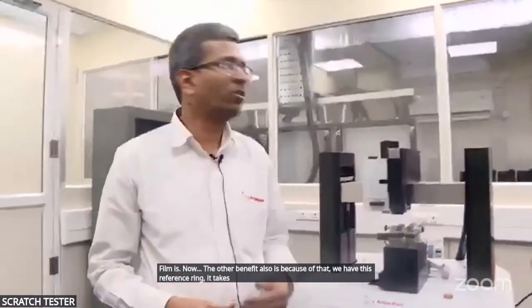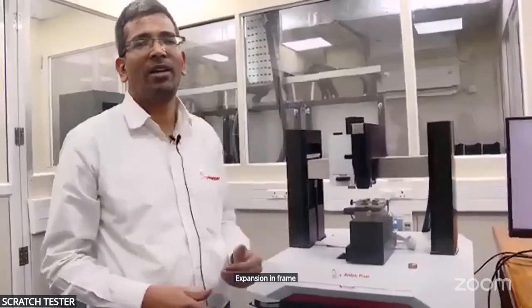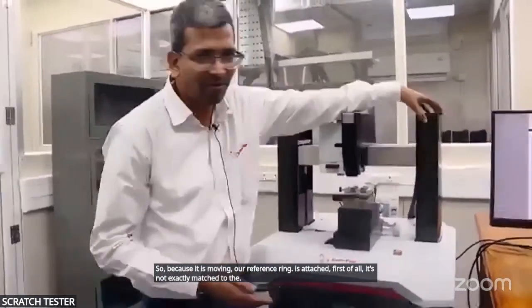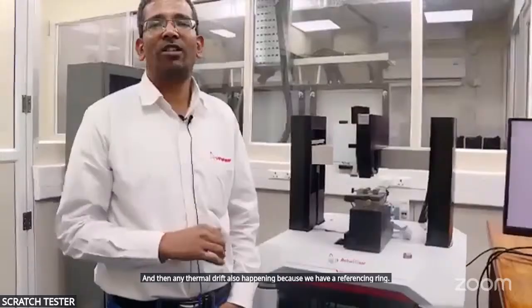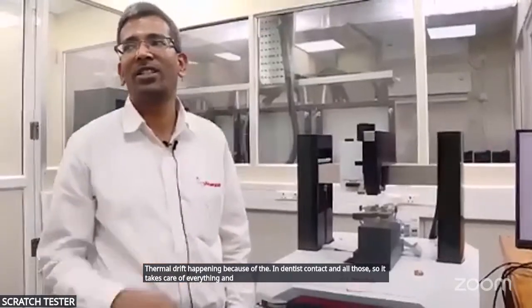Now the other benefit is that because we have this reference ring, it takes care of your thermal drift also. Say we have our frame and the temperature is varying. In India we know it varies much during different weathers. So there is some expansion in the frame, and when we are talking about the nanoscale, that will give an error. Because our reference ring is attached, and first of all it's not exactly matched to the reference frame, any thermal drift happening, the frame expanding, or drift from the indenter's contact and all those, the referencing ring takes care of everything and you purely get the data from your film.